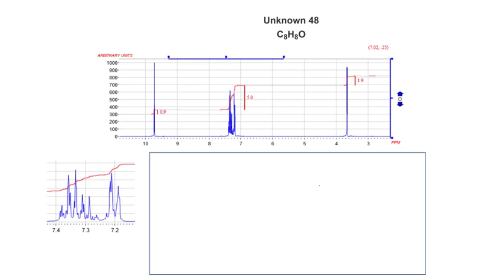Okay, here's another one for you. Take a good look, see what you can do. Pause the video, get back to me. Okay, we're back. We're going to dispatch this one very quickly. First, we spot this aromatic 5 hydrogens again. That takes care of a lot.